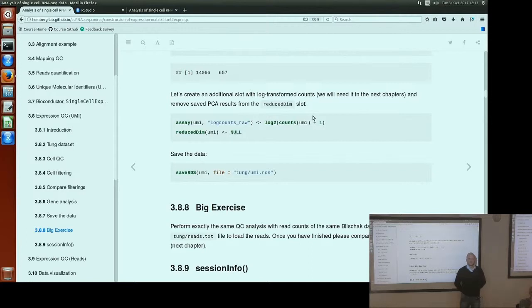If you use published data and you find that 25% of cells are bad, then it shouldn't have been published, right? Well, it shouldn't happen if you use public data. Usually public data is filtered, and if you read the methods, you would find that what's provided in the paper is already maybe 80 or 70% of the original data set.